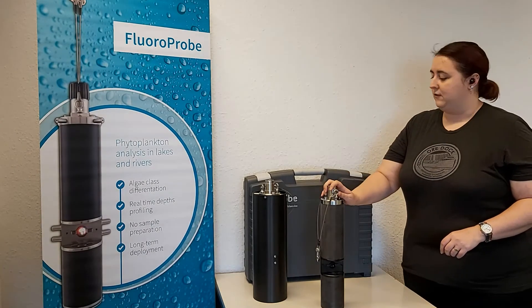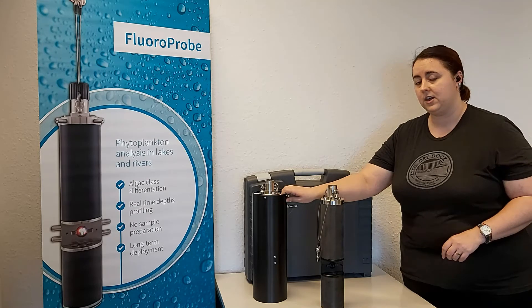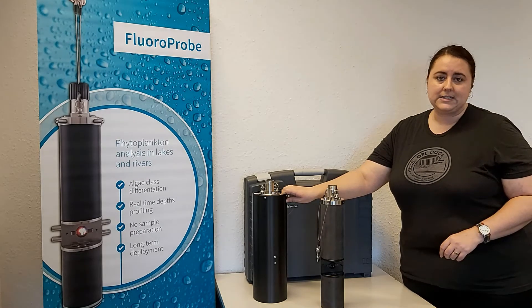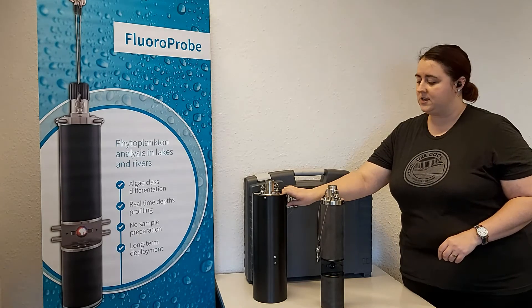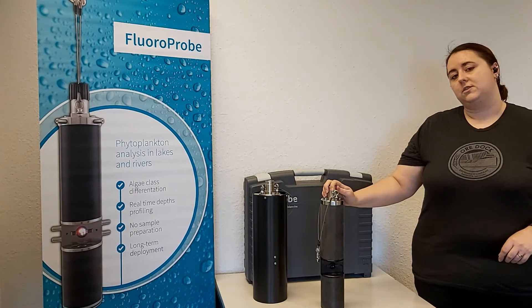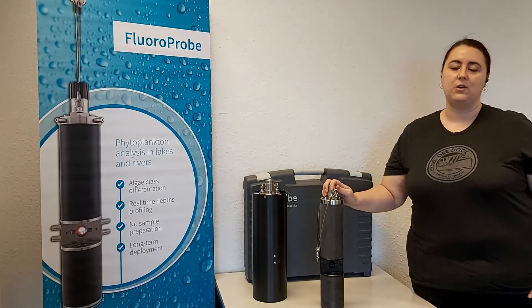When deploying this instrument in the field, you would put this hard plastic case around it here. This is going to protect it from any extraneous light and also from physical damage when being submersed. The FluoroProbe can be submersed up to 300 meters in the water and is also available in a titanium version for saltwater environments.